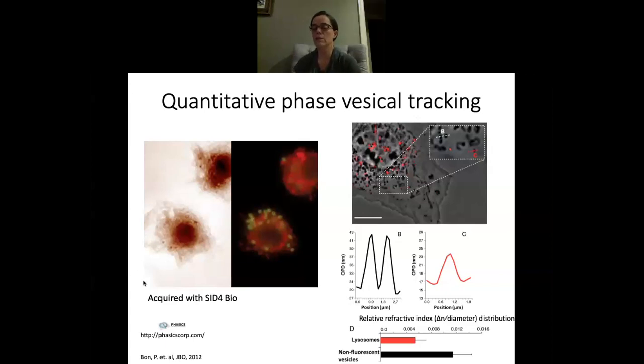Because the segmentation of the relative refractive index distribution isn't straightforward, it's not a straightforward analogy to segmentation of fluorescence images. The use of fluorescence overlay as a validation step at this stage in the development of quantitative phase imaging is a particularly powerful avenue for developing new methods and specific applications of quantitative phase imaging.